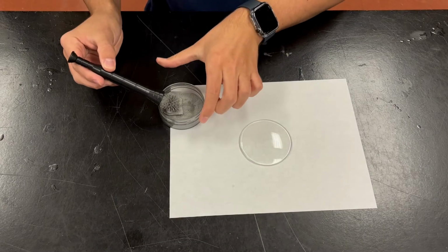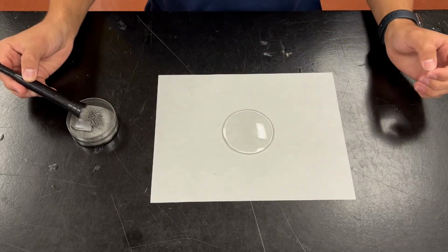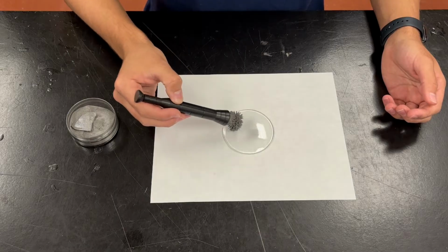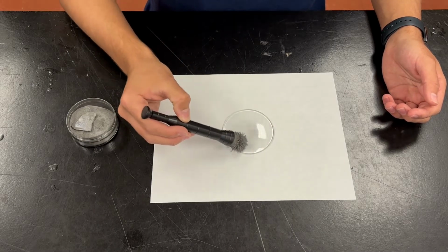Now that our brush is ready, we will apply the powder on the fingerprint. The movement we follow in this case is different from regular fingerprints. You want to make a circular movement, maintaining your hand at a constant distance from the fingerprint. Not too close, not too far. And just like that, you got it!